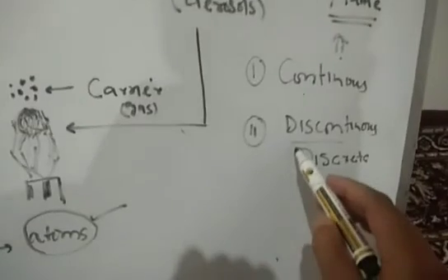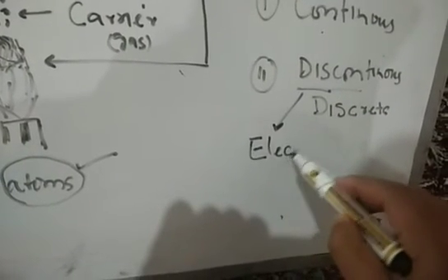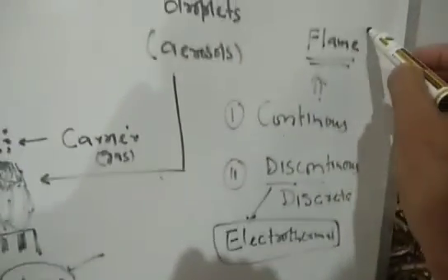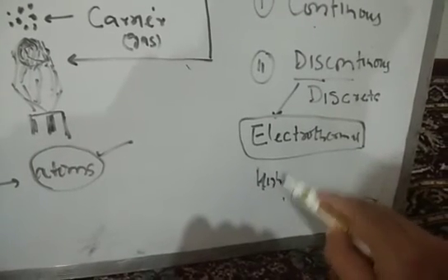And discontinuous, the example of discontinuous atomization is इलेक्ट्रोथर्मल एटोमाइजेशन. ये बहुत ही इंपॉर्टेंट है. अब दोनों में क्या डिफरेंस है, दोनों में क्या प्रोसेस इन्वॉल्व है, दैट विल डिस्कस इन अ सेपरेट टॉपिक. बट यहाँ पे जस्ट वन पॉइंट दैट द इलेक्ट्रोथर्मल जो एटोमाइजेशन प्रोसेस है, इट इज हाईली सेंसिटिव. So it is highly sensitive compared to your flame atomization.